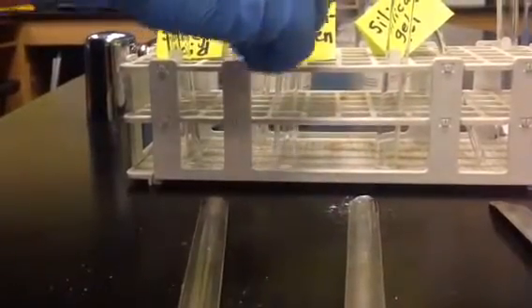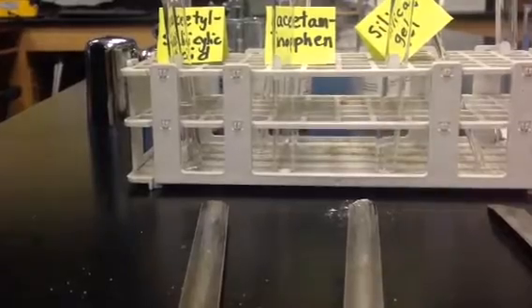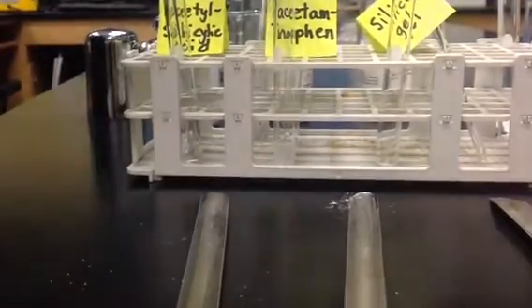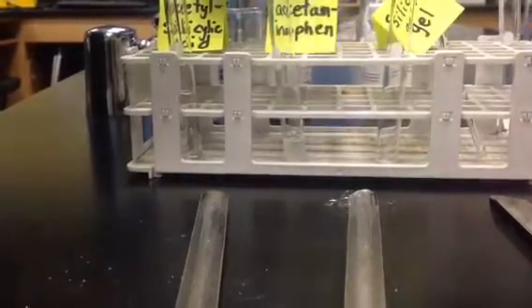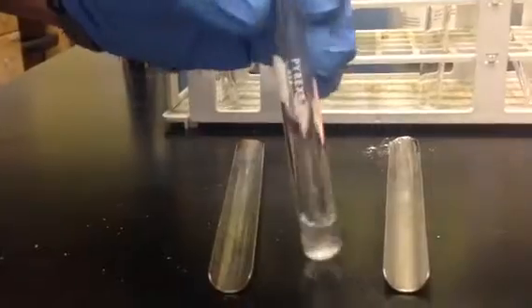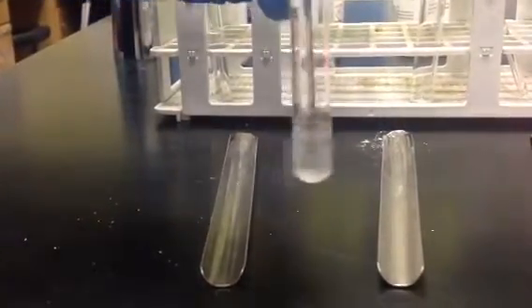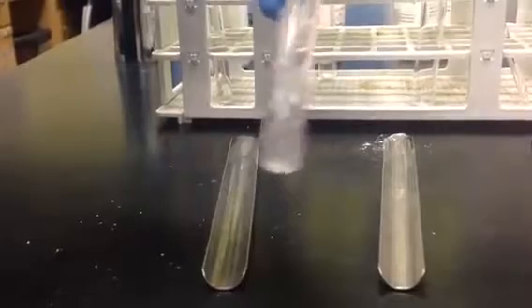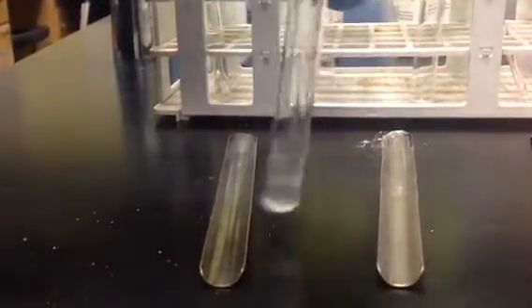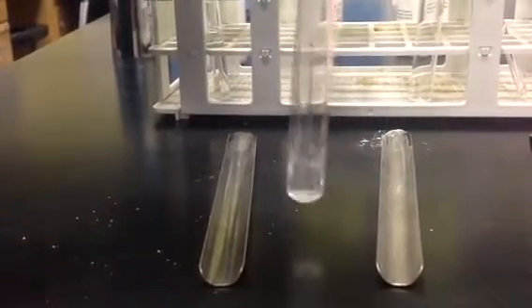And then we're going to do the same thing to the acetaminophen. I'm going to add a dropper full of the ethyl acetate. Again, we're going to stir vigorously, trying to get it to dissolve. It looks like maybe some is going in, so I keep stirring.